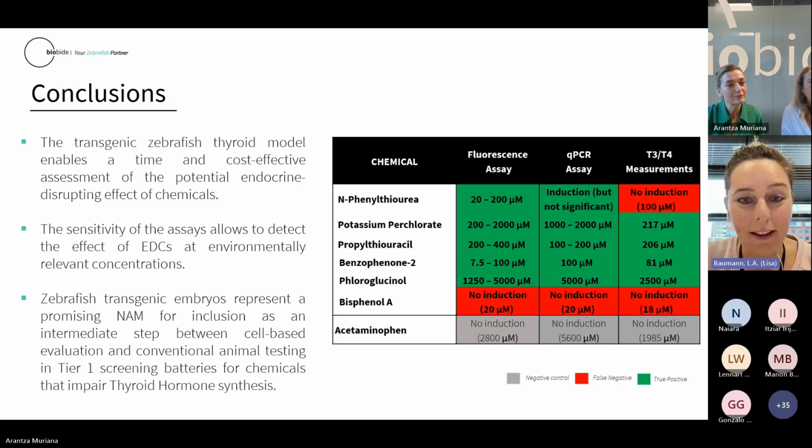As you know, there are many activities ongoing on that. Therefore, I have some technical questions, especially about the negative control, because we just discussed in the OECD thyroid disruptor expert group that it's very difficult to find negative controls for thyroid hormone system disruption. I was wondering if you tested other compounds and had some false positives there, because there is a similar test using zebrafish with T4 antibody staining in the follicles, and ampicillin, which is normally negative in any other assay, for example with Xenopus, turned out to be a false positive. I was wondering if you tested that or others that were false positive.